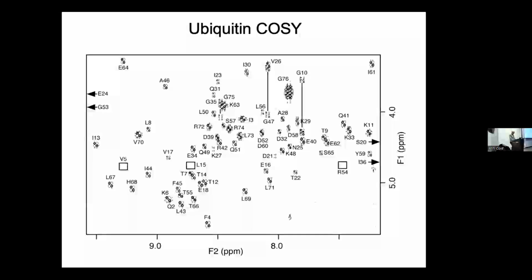If we zoom in, you can see, in most of the spectra I'll show you, a contour with a single line is a negative peak, and contours with multiple lines are positive peaks. And you can see, just as our operators predicted, the cross peaks are antiphase in both dimensions. We had antiphase operators during T2, and they had a sign modulation with respect to the J coupling during T1. So we know they're going to be antiphase in T1.